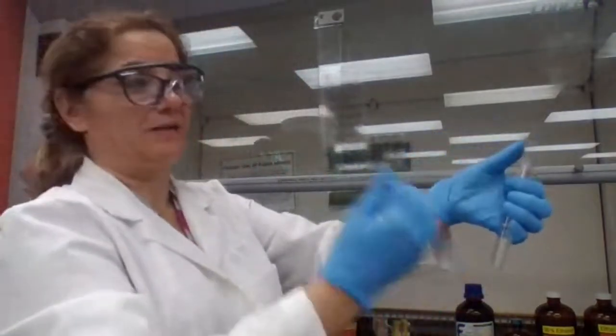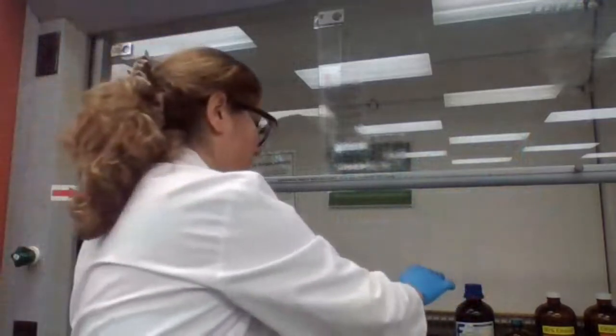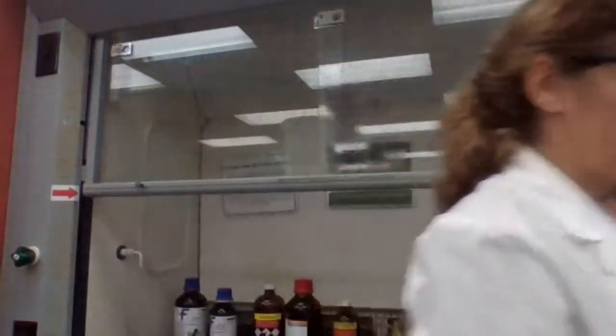Now, I'm going to divide this in 3 so I can test my 3 compounds. So we bring the test tubes.